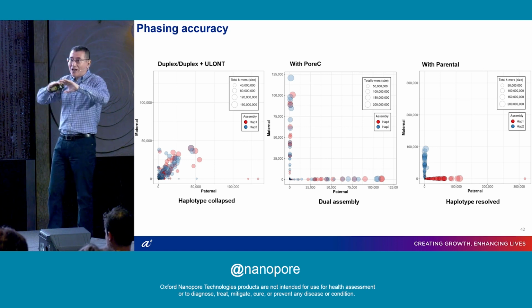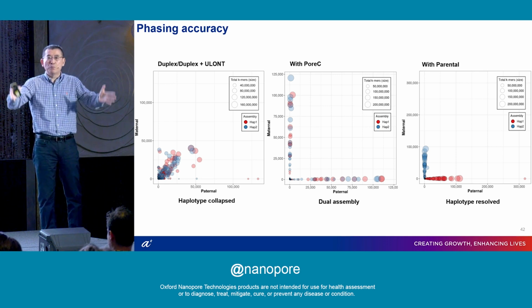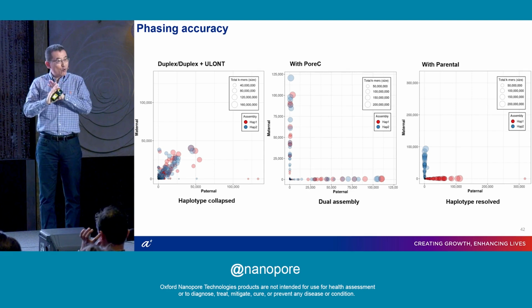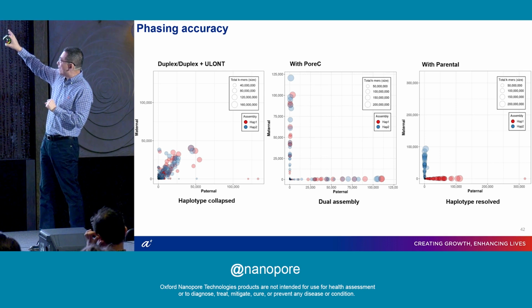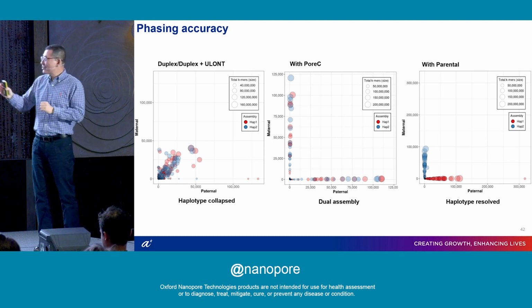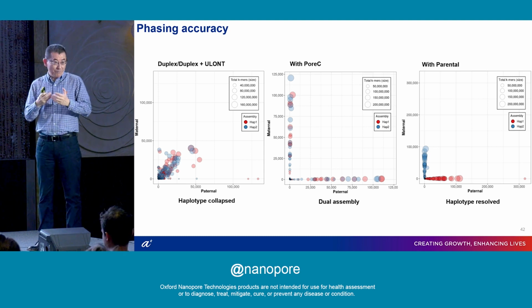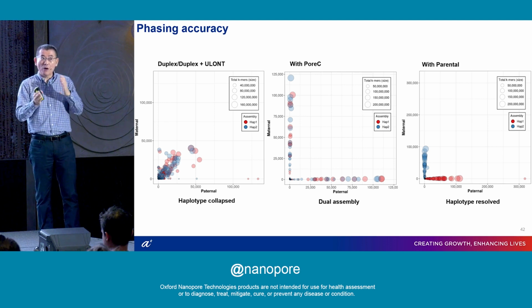But they artificially divide the contigs into two pools. They're referred to as HAP1 and HAP2, but they're not really representing parental origin. That's why, if you look at the HAP1 group in red and the HAP2 group in blue, some contigs are actually from paternal, some contigs are from maternal, even though they belong to one haplotype group. So they cannot tell the parental origin.